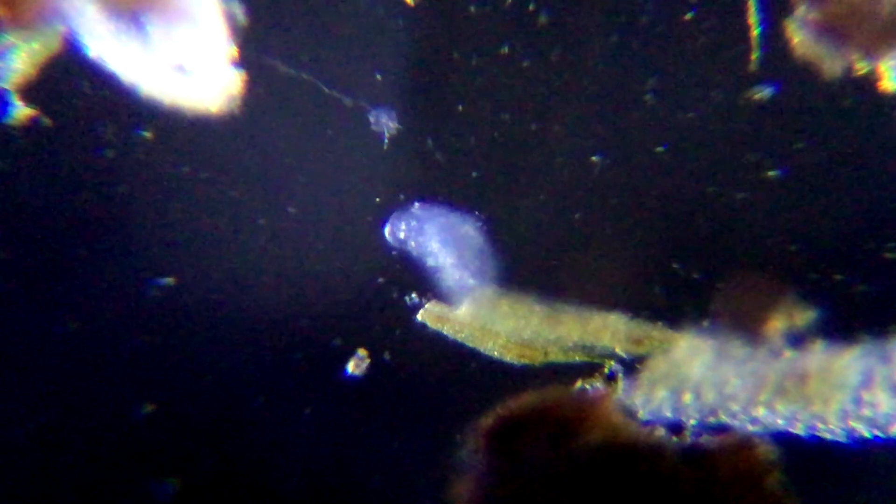Here's a tardigrade in darkfield. Darkfield is illuminated from the top, so when it's illuminated from the top, it's more like what it would look like to us — you can see more of the normal colors. Whereas when we're normally looking at it, it's been illuminated straight up from the bottom, so it looks very different — that's why everything looks white. And it's called darkfield because everything is dark. It looks a lot shinier and you can't see the water quite as well.